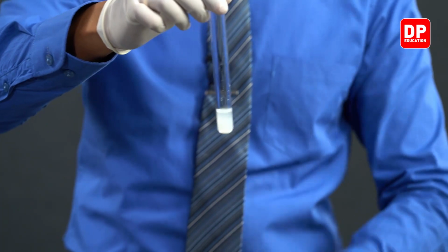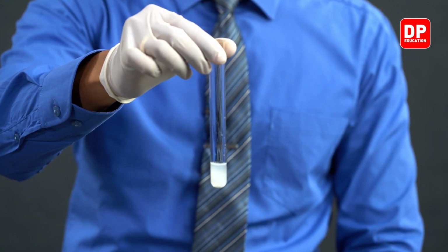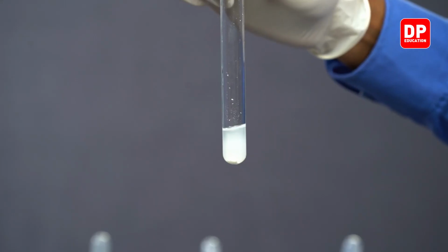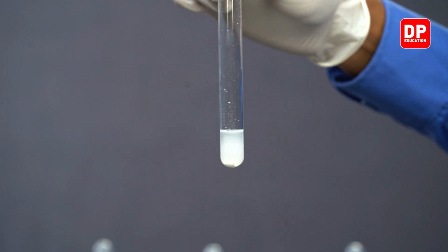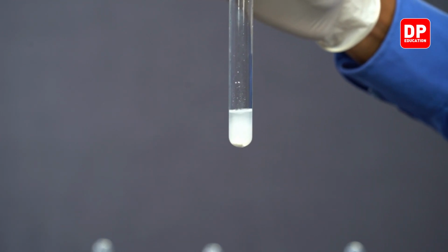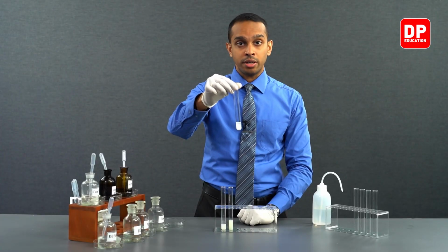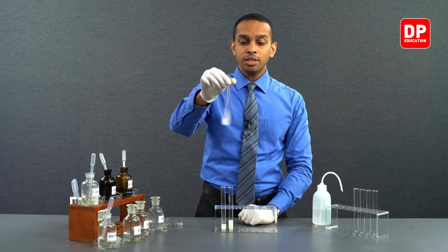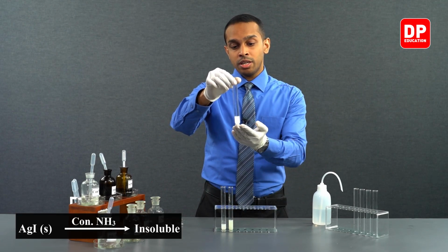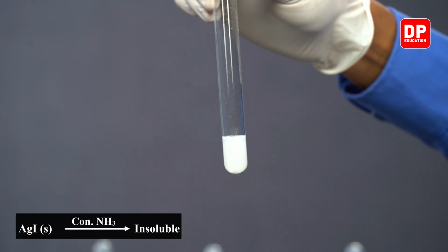Now, in the previous two instances, as you added concentrated ammonia into silver bromide and as you added dilute ammonia into silver chloride, upon addition of these reagents, we saw an immediate change taking place. That is the dissolution of the solid. But once you add concentrated ammonia into silver iodide, you can see no change takes place.